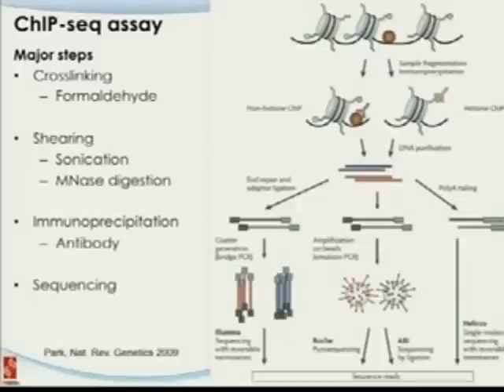Once we go to the different studies, you will read that more carefully, and usually it's about 200 base pair to 300 base pair. You only sequence the beginning part of it, right? So remember, it got fragments, short reads, right? We only sequence the very beginning part of it, and in the middle we won't. But if this cutting is random, which you get with sonication, that in theory generates more random cutting locations. If this is a DNA, you can cut here, sometimes cut here, so you have better coverage of the local fragments.